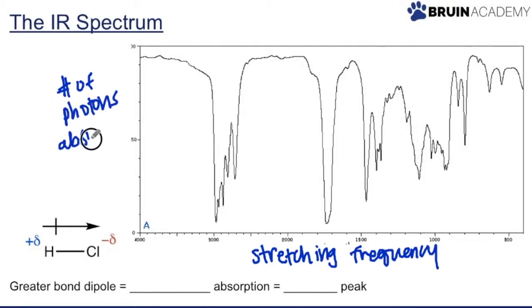All right, and a good thing to know about peaks within the IR spectrum has to do with the intensities of the peaks, whether it's really deep, going down towards the bottom, versus something weak, which doesn't have much depth here. That has to do with the polarity of the bond in our molecule.